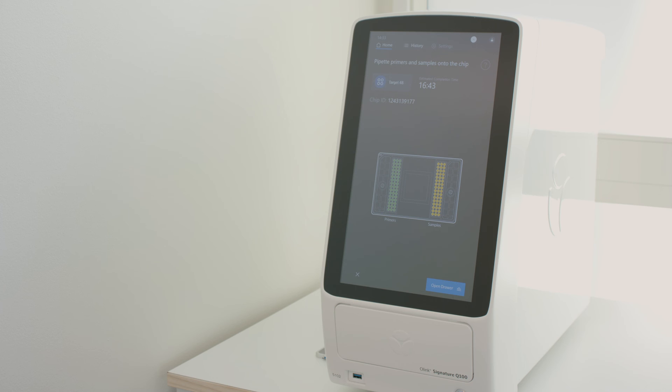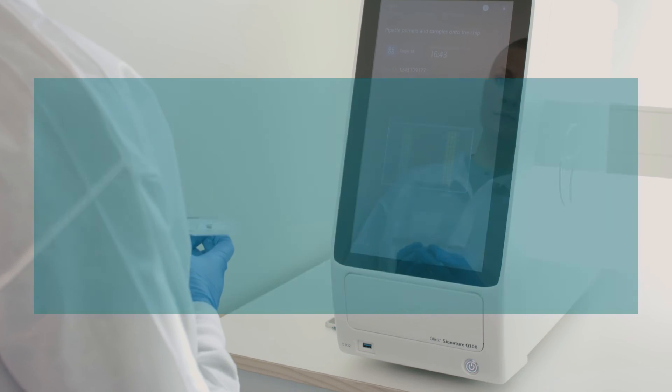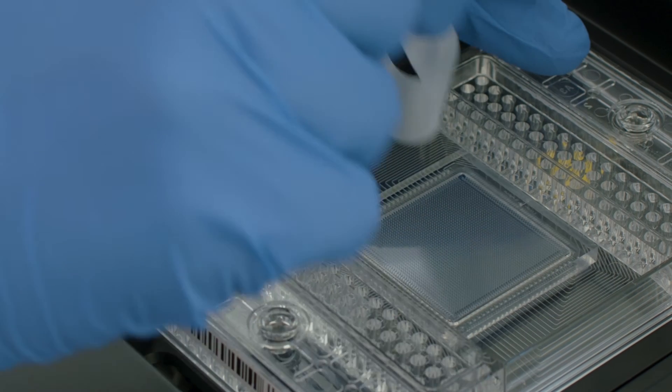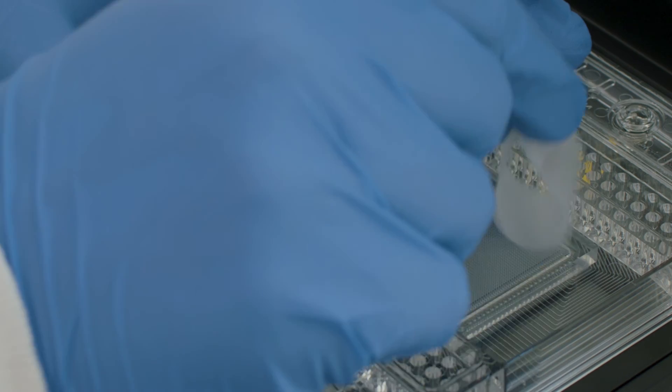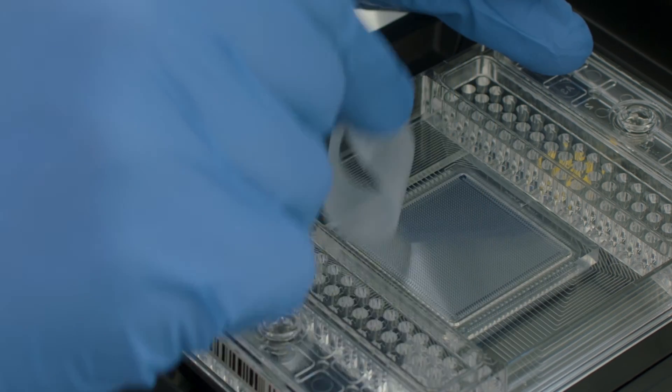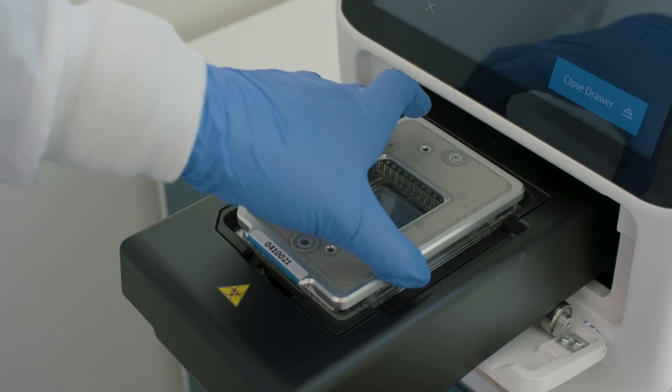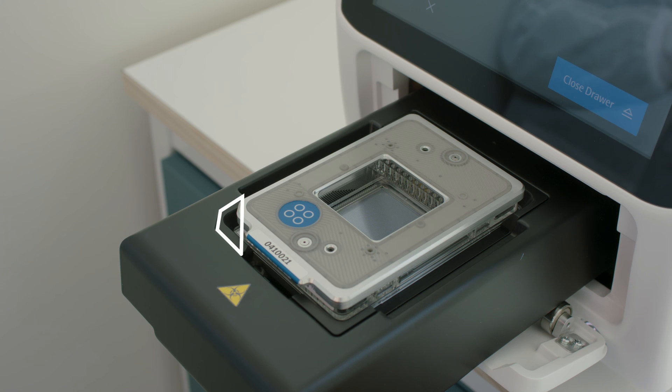With the Insert the Chip Containing Samples screen on display, place the IFC in the drawer. Use clear tape to remove any dust particles or debris from the IFC surface if necessary. Place the interface plate over the IFC. Align the notched corner of the IFC with the notch on the drawer and face the barcoded edges of the IFC and interface plate forward.